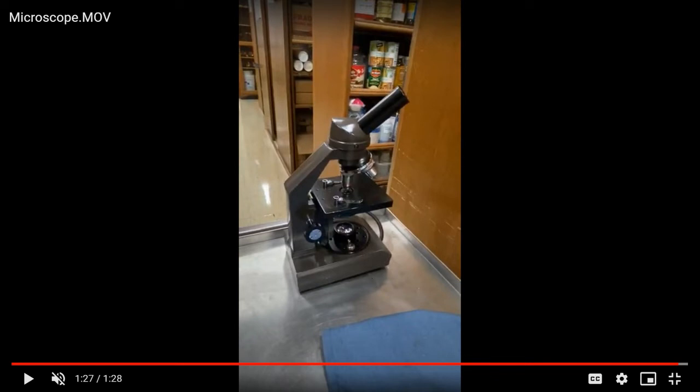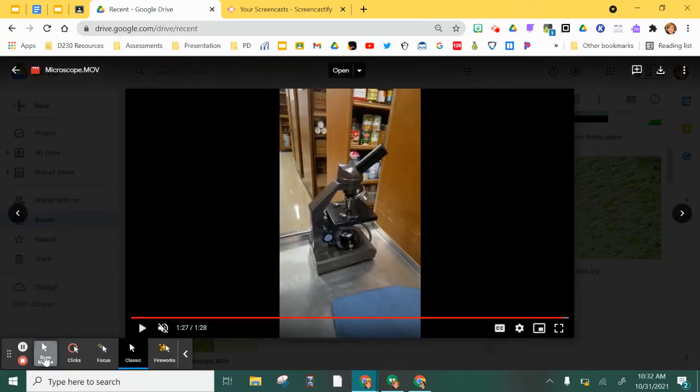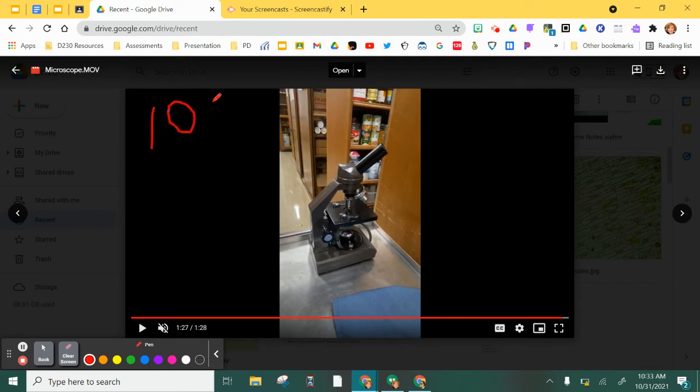Now, in terms of magnification, a couple of things here. How do you actually know how much the image is magnified when you're looking at it through the microscope? Well, first off, remember we said that the eyepiece has a magnification of 10x. If you're under low power, which again is the shortest objective lens, it has a magnification of 4x. So you multiply those two numbers together, and if you're looking under the low power objective lens, you're looking at something that's been magnified 40 times its original size.